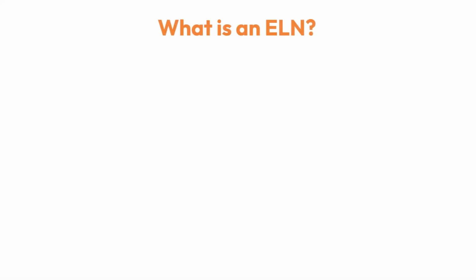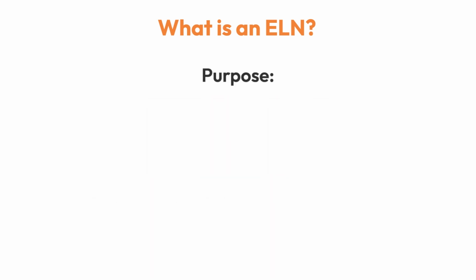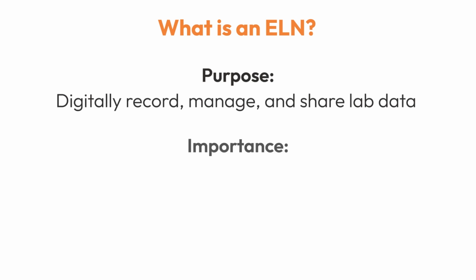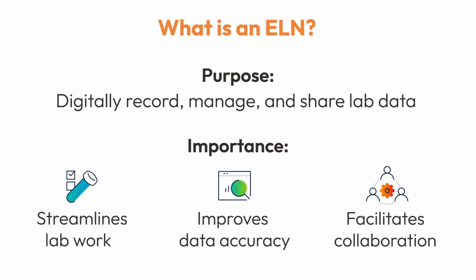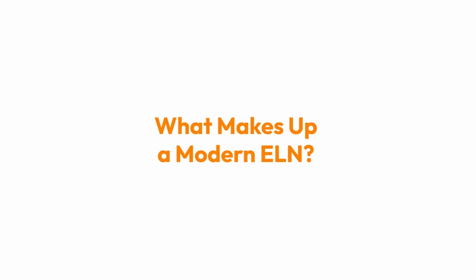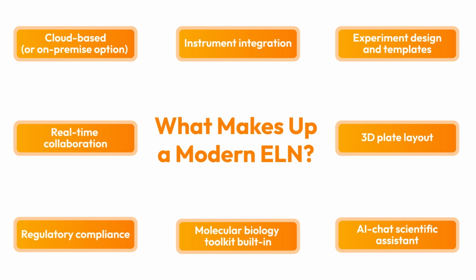An electronic lab notebook, or ELN, is a digital tool that replaces traditional paper lab notebooks. This software allows scientists and researchers to record, manage, and share their lab data efficiently and securely. Modern ELN platforms offer features like cloud-based access, data integration with other laboratory instruments, and compliance with regulatory standards, making them indispensable for today's labs.